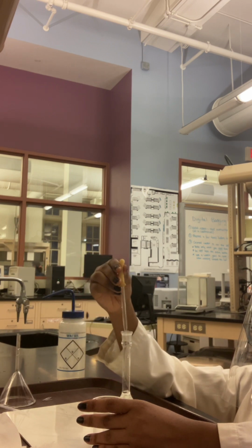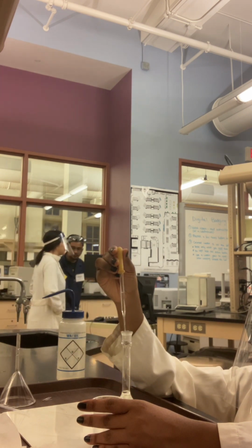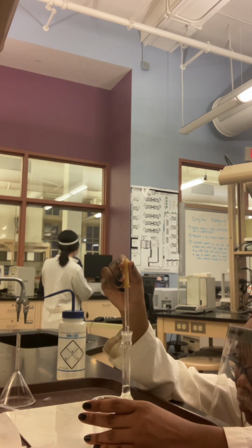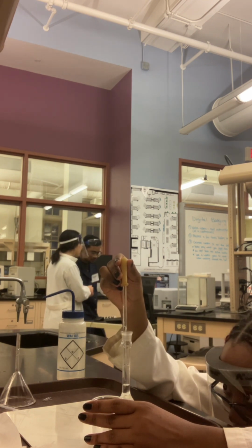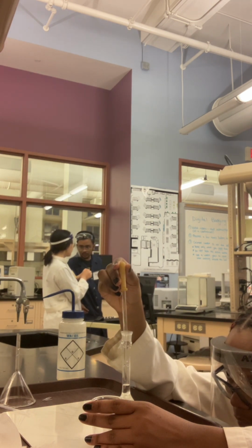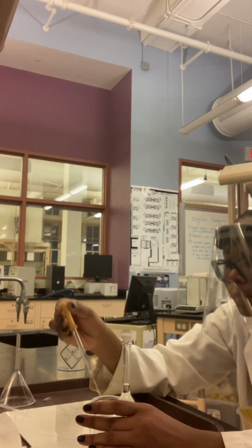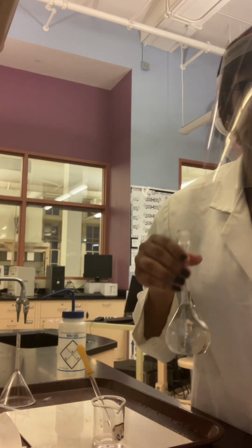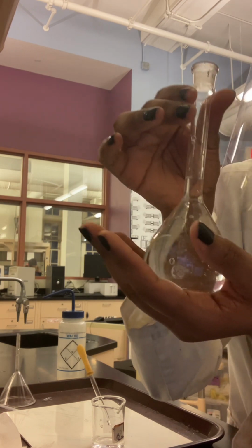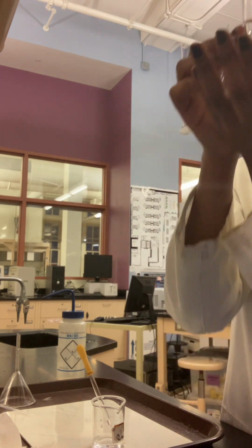Once again, viewing the calibration mark at eye level to ensure that the bottom of the meniscus is at the calibration mark. And so this is the level of liquid relative to the calibration mark.